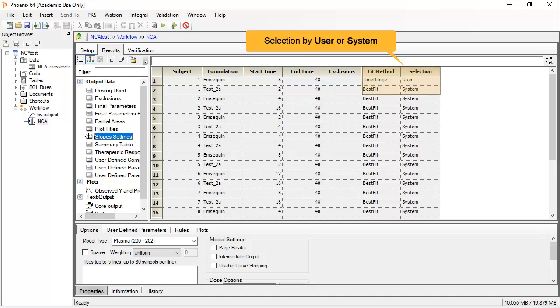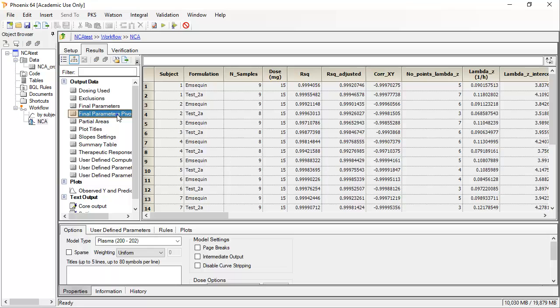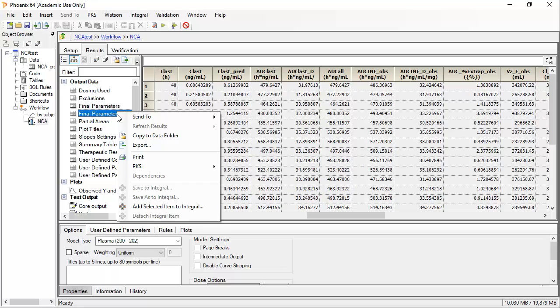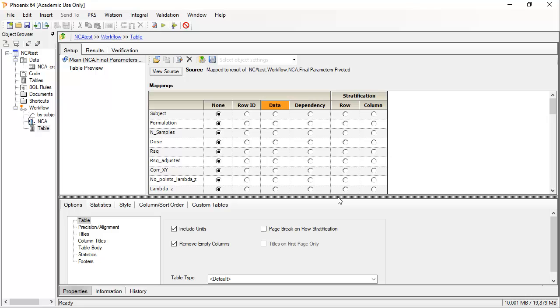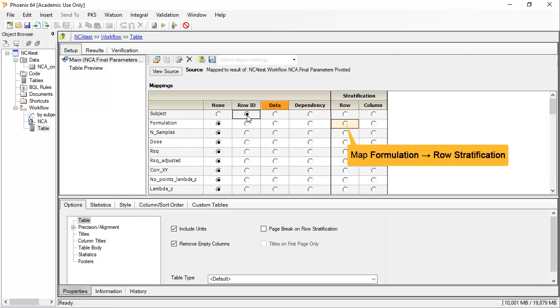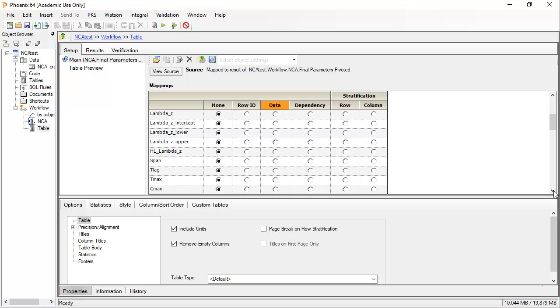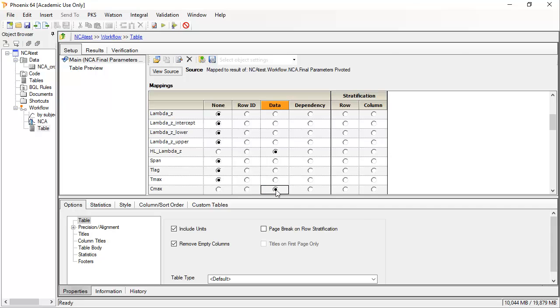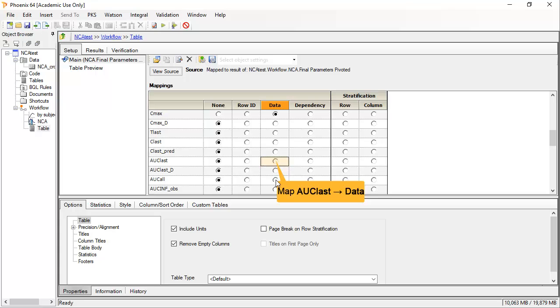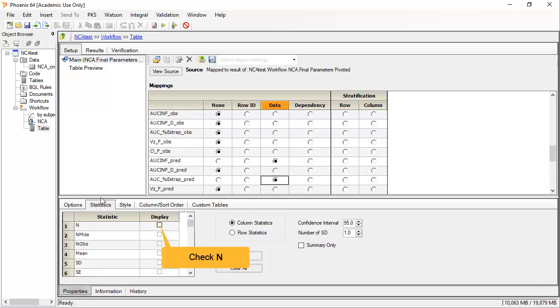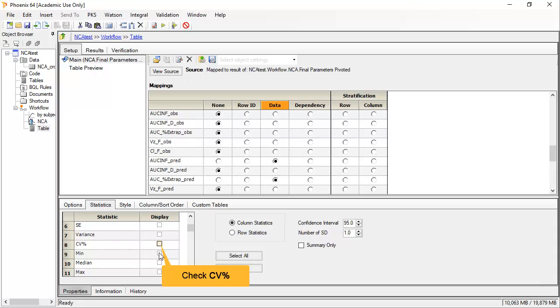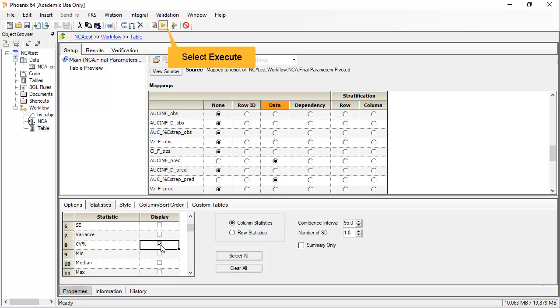Let's move on to the final parameters calculated. To summarize the key parameters, one can right-click on the results worksheet and send it to a table. Several table presentations can be created. I will map Subject to Row ID and Formulation as row stratification. I'll select some parameters to be presented, like half-life, Cmax, and a few other common parameters, to form the body of the table. Now select the Statistics tab in the lower panel and choose your desired statistics. Once more, click the green triangle to generate this table.